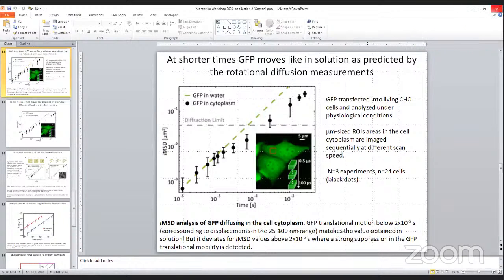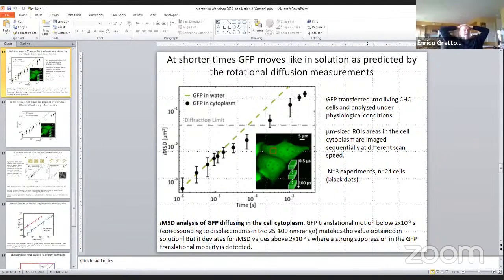You also consider, Ernesto, that you are averaging a region, because it has at least 32 or 64 pixel square. Yeah, but the pair correlation function, you don't have this limitation in some way, because you move the point. Exactly.